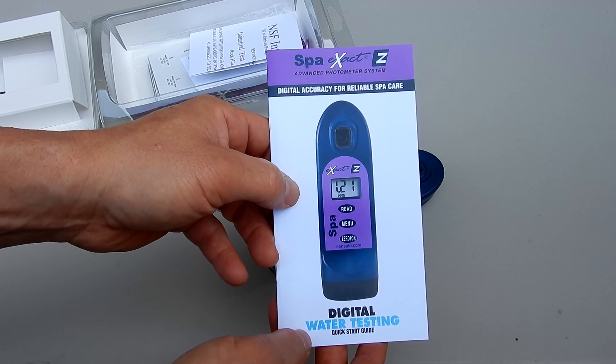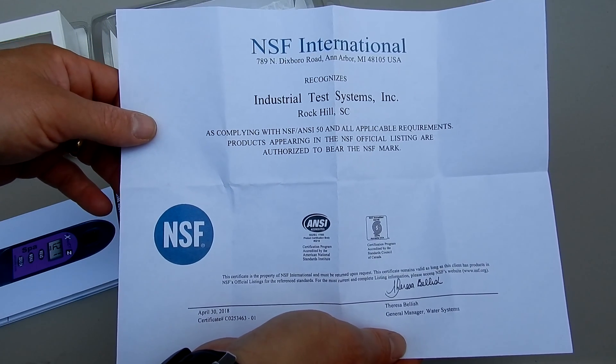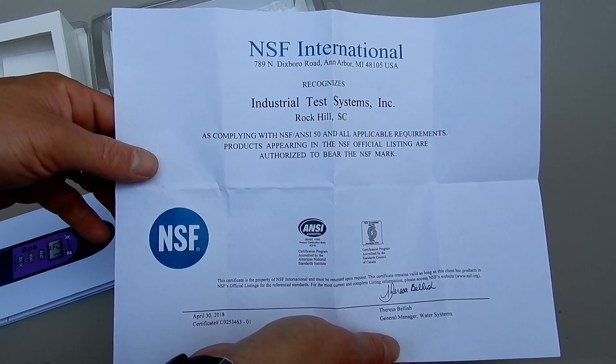Also included is a quick start guide. It is also a certificate signifying that the Spa Exact EZ is NSF approved. This means that it has been independently certified for commercial pool use.